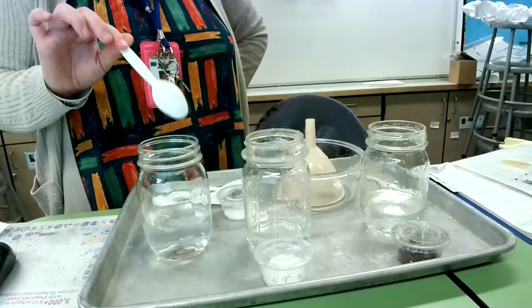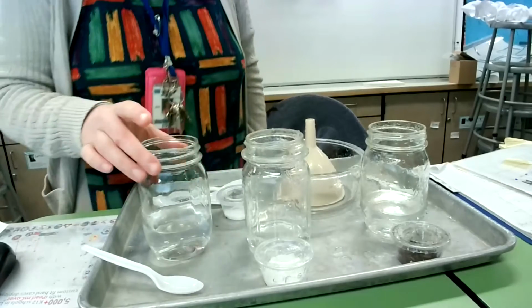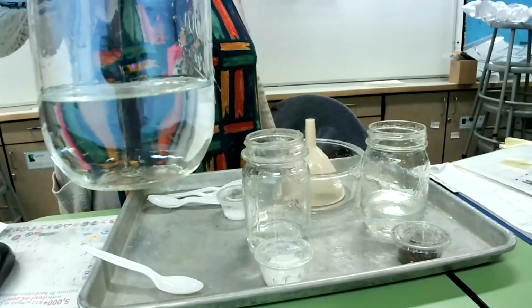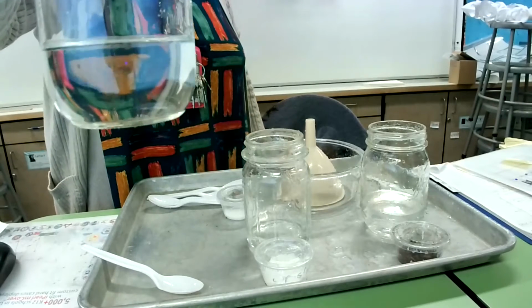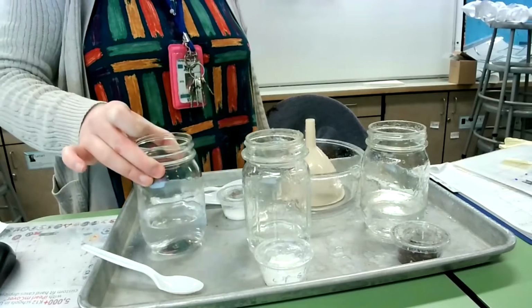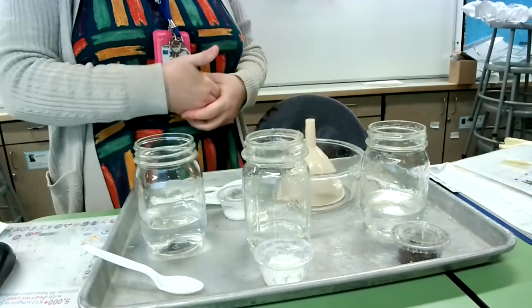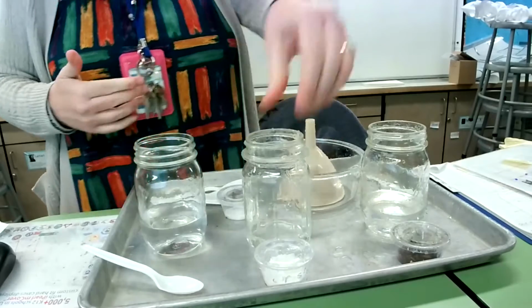Okay, so I think most of that is dissolved, and it looks like we have a clear liquid with a few granules. If I kept stirring, those few granules still swirling around would dissolve as well, okay? If this was hot water, the sugar would have dissolved a lot faster. So is the sugar soluble? And the answer is yes, sugar is soluble.